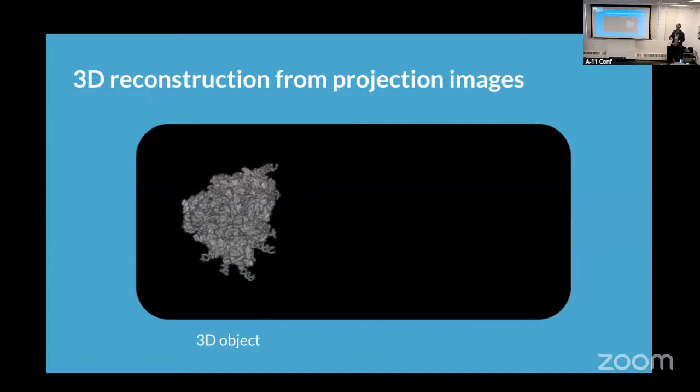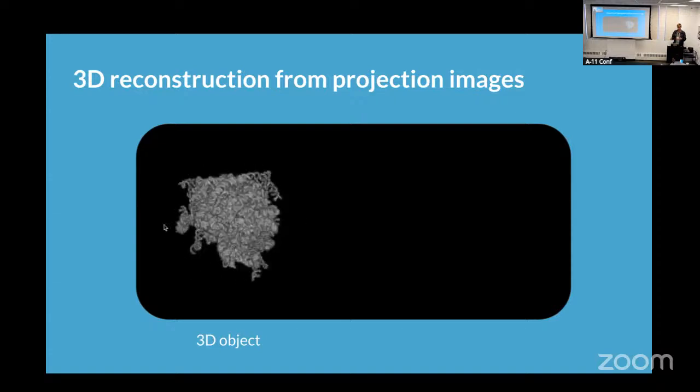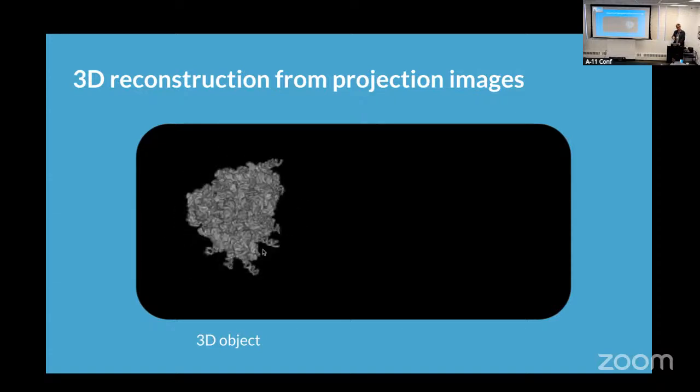So yeah, tilt series processing is a superset of frame series processing. So I'm going to go back to some theory for frame series processing, and hopefully this will be useful for grounding us when we then build up to tilt series.